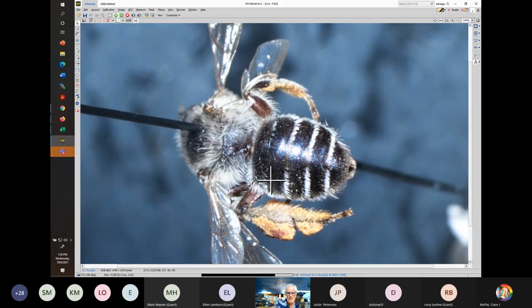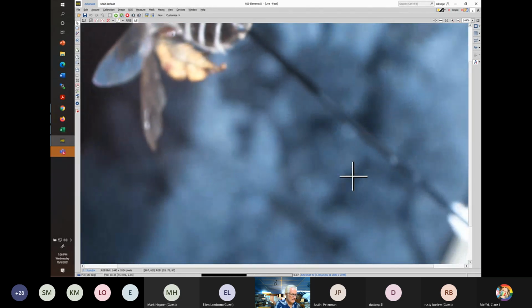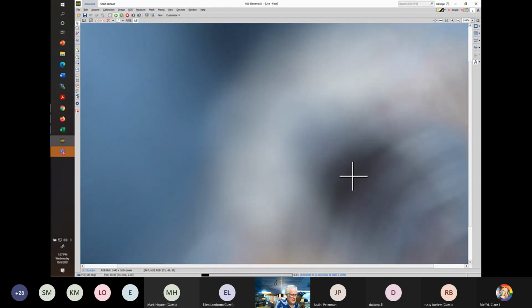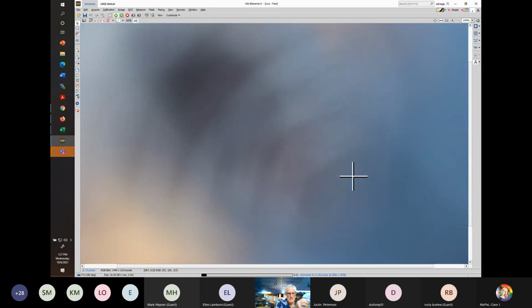So here is our specimen, T1, 2, 3, 4, 5, 6. So we have to zoom in and change the position so we can see it better on the T6 and add a bunch of magnification. And see what we can see.